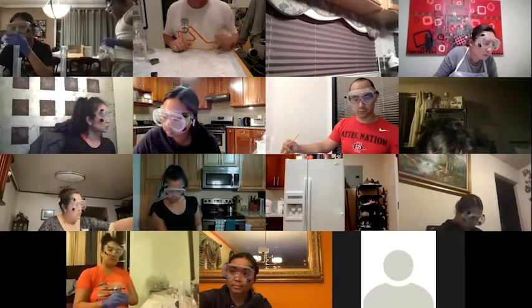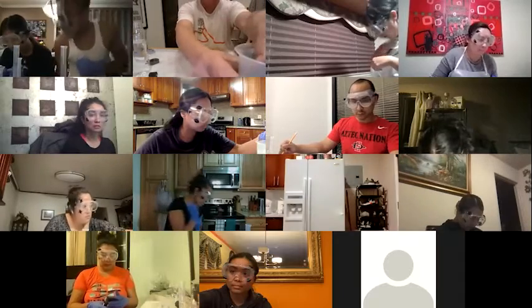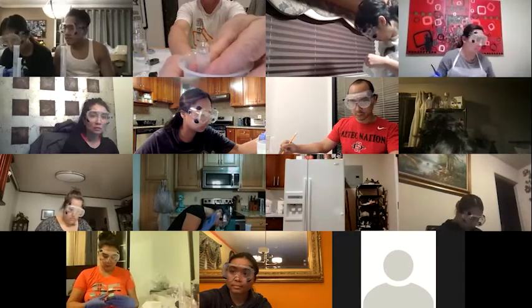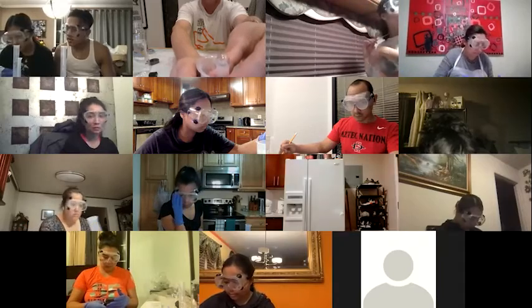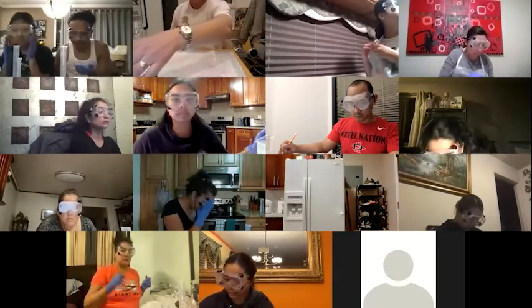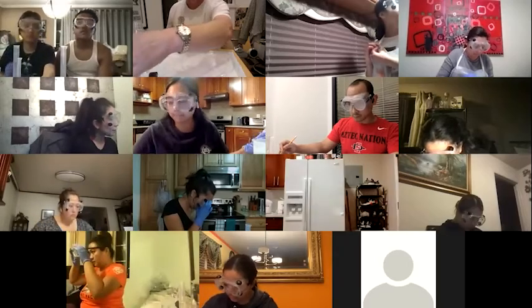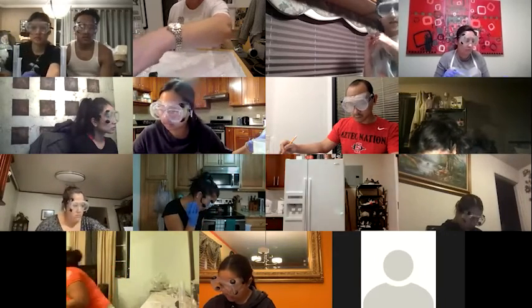Because in the time so far, that much gas has been produced in about 5 minutes. Whereas when I use the concentrated HCl, the tube is pretty much half full in about 2 minutes. So it'll work. It'll just test your patience.